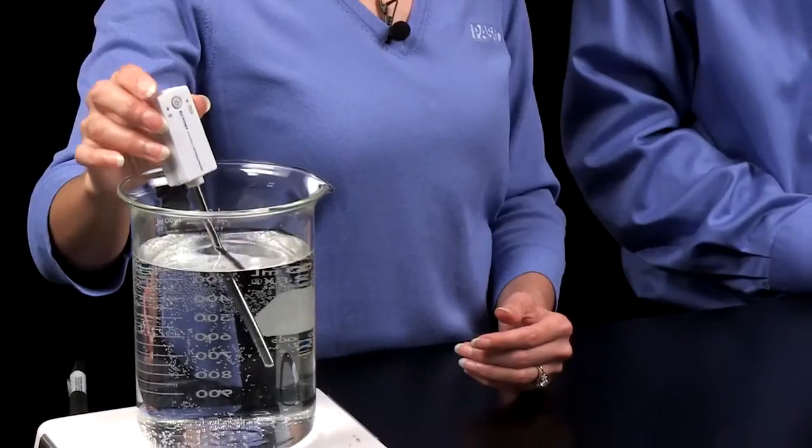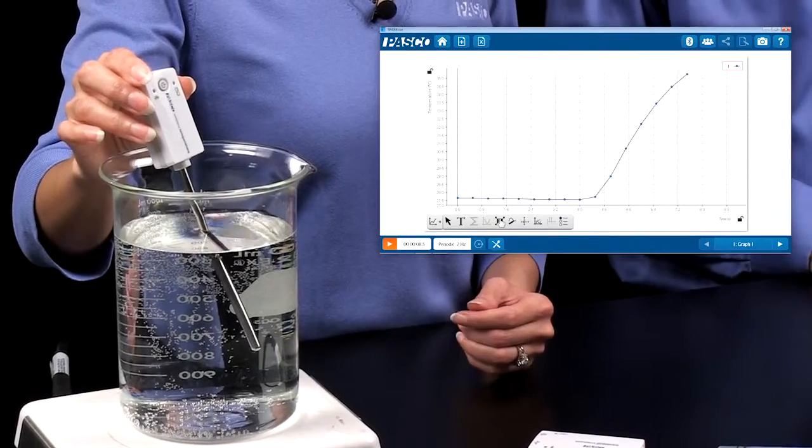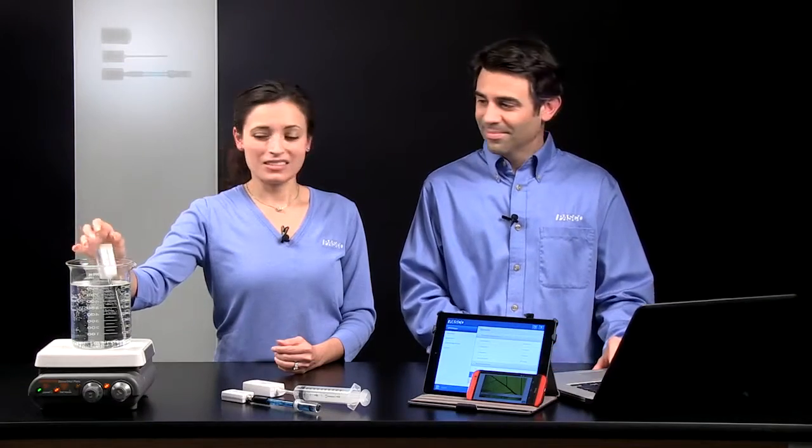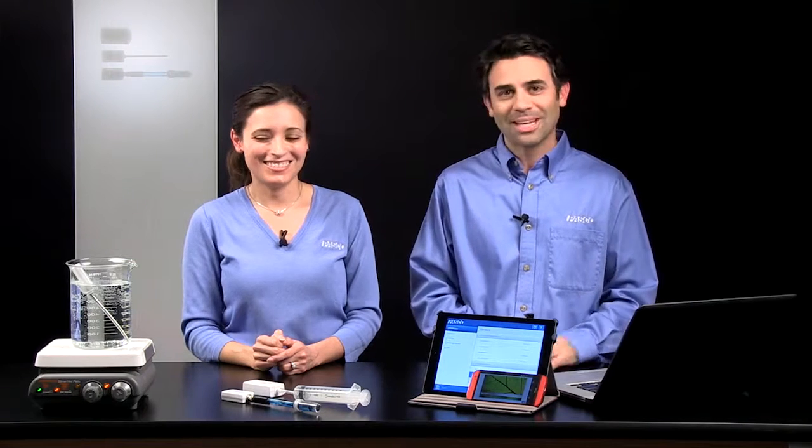And a hot water bath. We can definitely see that temperature change. Yeah. Oops. And because they are rugged and water resistant, they will definitely be able to withstand those student oops that you're bound to have in your classroom.